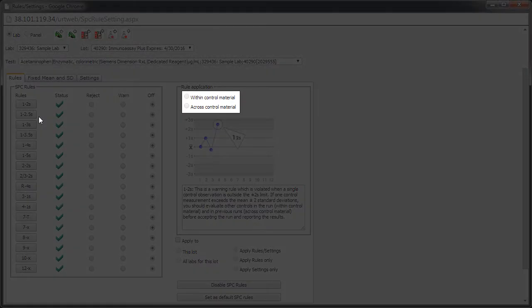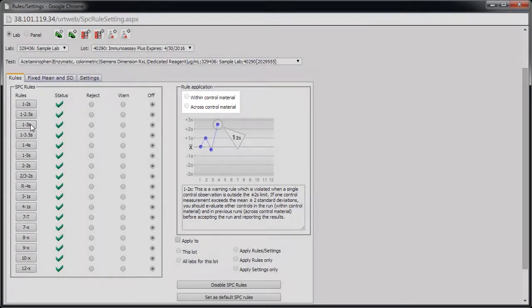Some rules have two applications, within and across runs. Both will be applied in the software, but you can select them separately to see the explanation.